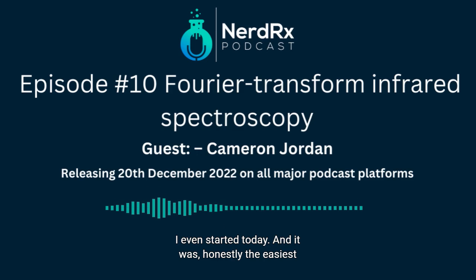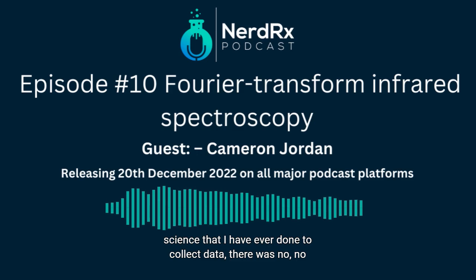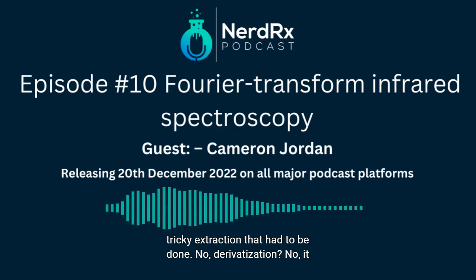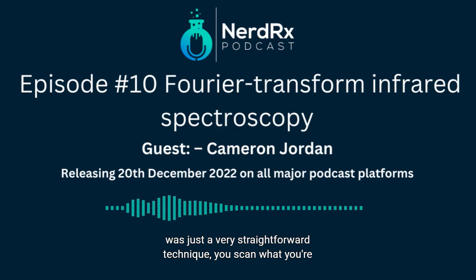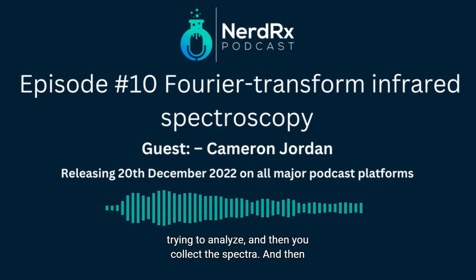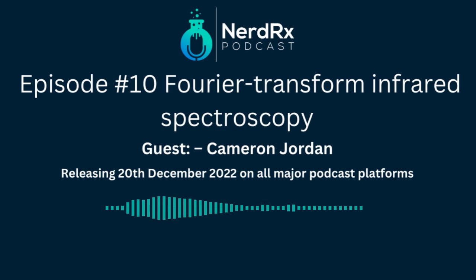It was honestly the easiest science that I have ever done to collect data. There was no tricky extraction that had to be done, no derivatizations. It was just a very straightforward technique. You scan what you're trying to analyze, and then you collect the spectra. And then once you've collected enough spectra, you can move on with the modeling.